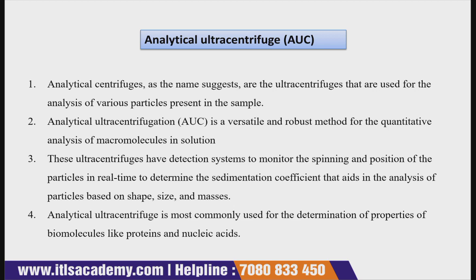So the analytical ultracentrifuge is the most commonly used for the determination of properties of biomolecules like protein and nucleic acid. It has a very wide range of application whenever you want to determine the properties of different biomolecules, for example proteins, for example nucleic acid.